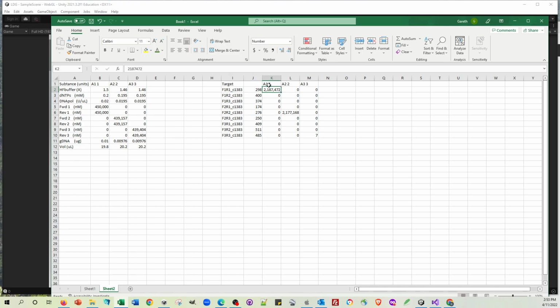And because tube number 1 has both of those primers in it, in good amounts, you get plenty of that amplicon produced. But you don't get any of this amplicon produced in tube 1. In fact, you don't get any of this amplicon produced in any of the tubes because none of the tubes contain lots of forward 1 and reverse 2.